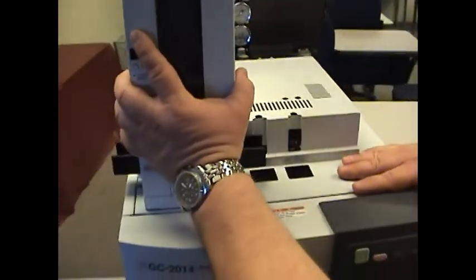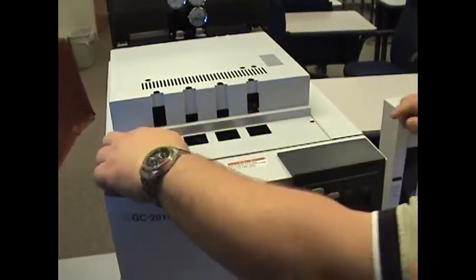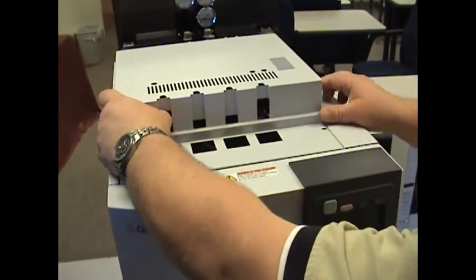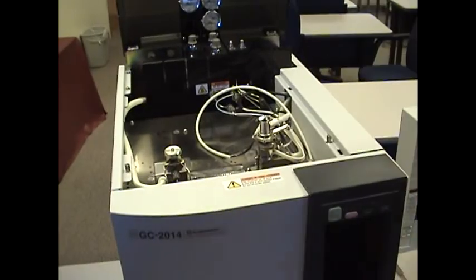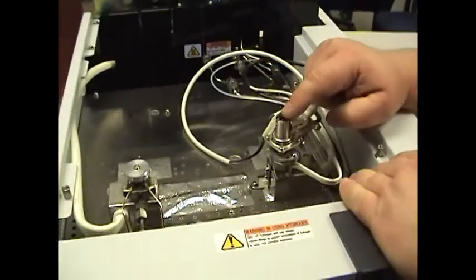Next, remove the two screws on the top cover. That's going to expose the top of the FID detector.